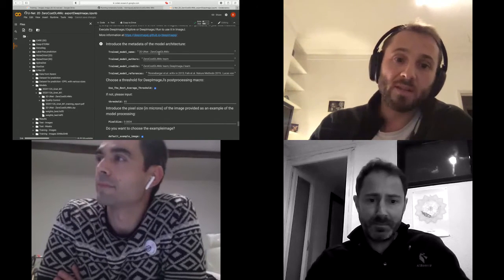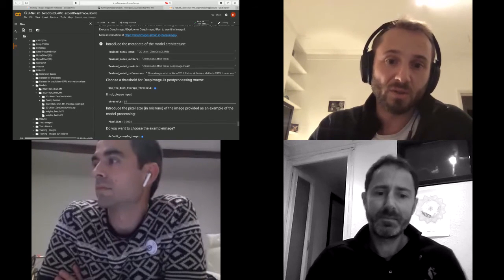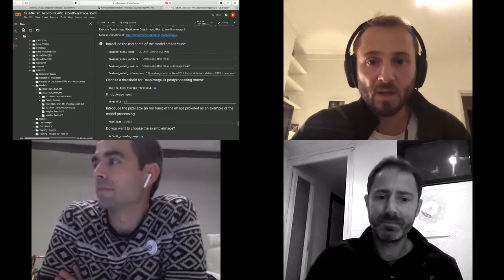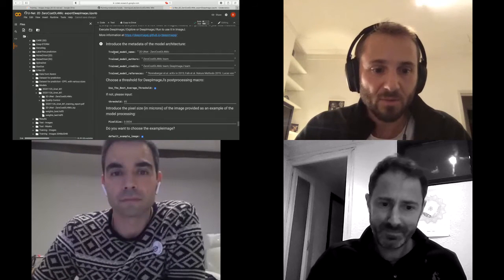So you could easily run training on Google Colab at zero cost, and then run as many inference and predictions as you wanted on Fiji. And with this, that's my transition to Esti.